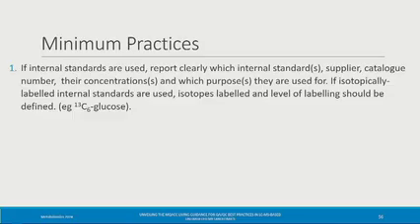I think the practice emerged when the predominant workflows were direct infusion, right? When all the lipids were in the source at the same time. So at that point it was maybe more applicable. Now as we moved more towards reverse phase methods where the internal standard is not coeluting with all the lipids from the class, it's becoming more problematic.